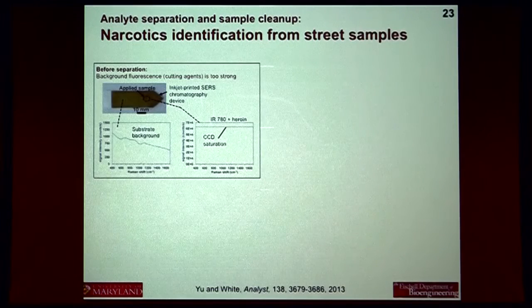So why is melamine migrating? So melamine is a small molecule, whereas all these proteins are getting stuck on the PVDF. So you pick the right mobile phase that melamine is soluble in and won't stick to the membrane. So you can't just use anything. Water probably wouldn't have worked, but you choose the right mobile phase that you have good solubility for what you want and not for what you don't want, and you get that separation.